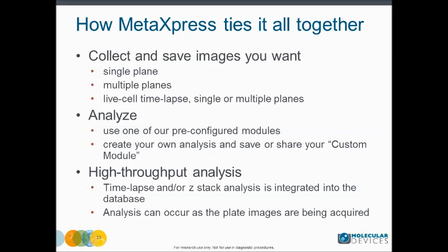In summary, the MetaXpress software ties it all together since it's used to acquire your images either as a simple single plane or multiple planes, or as a single endpoint or multiple time points for a few minutes or up to a few days if your instrument has the environmental control option. Then MetaXpress is used to analyze the images, and all images and data are stored in our provided database to be recalled from any networked computer.